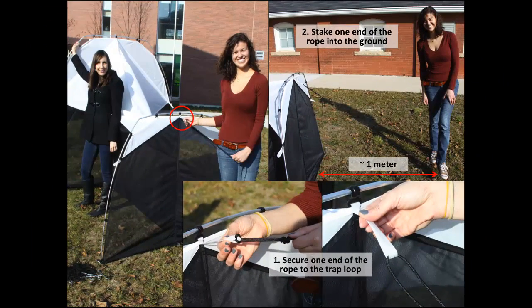Starting at the back end, secure one end of a rope to the middle loop at the top of the back end of the trap. Use whatever knot you are most familiar with. Using a metal peg, stake the other end of the rope into the ground about one meter directly away from the trap. With moderate tension in the rope, the back end of the trap should be held firmly perpendicular to the ground.